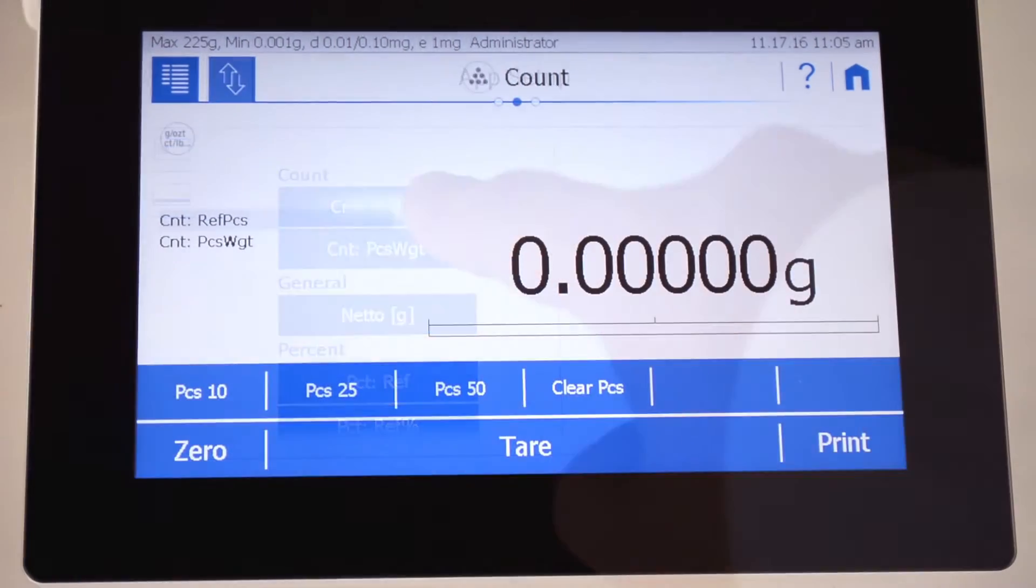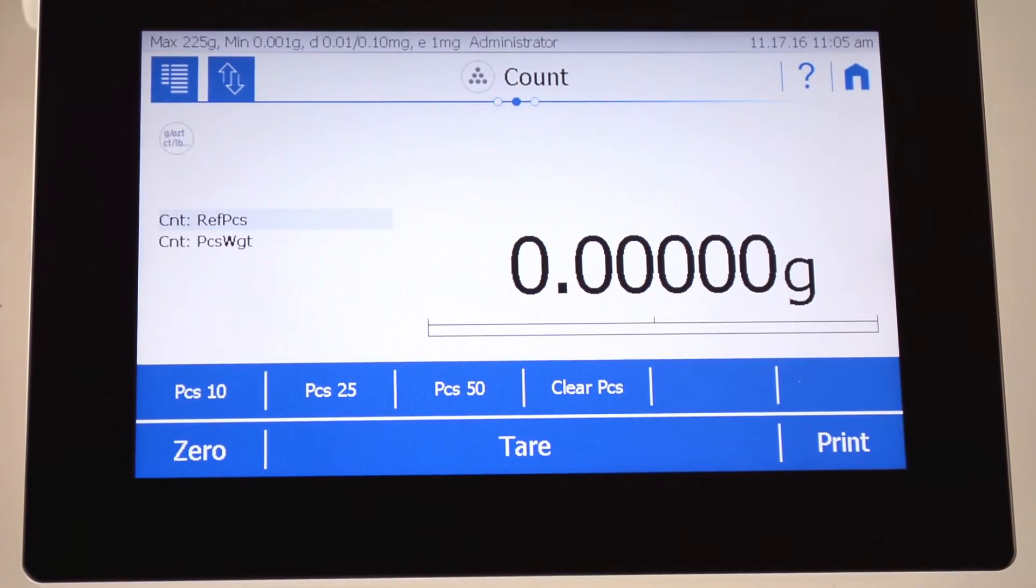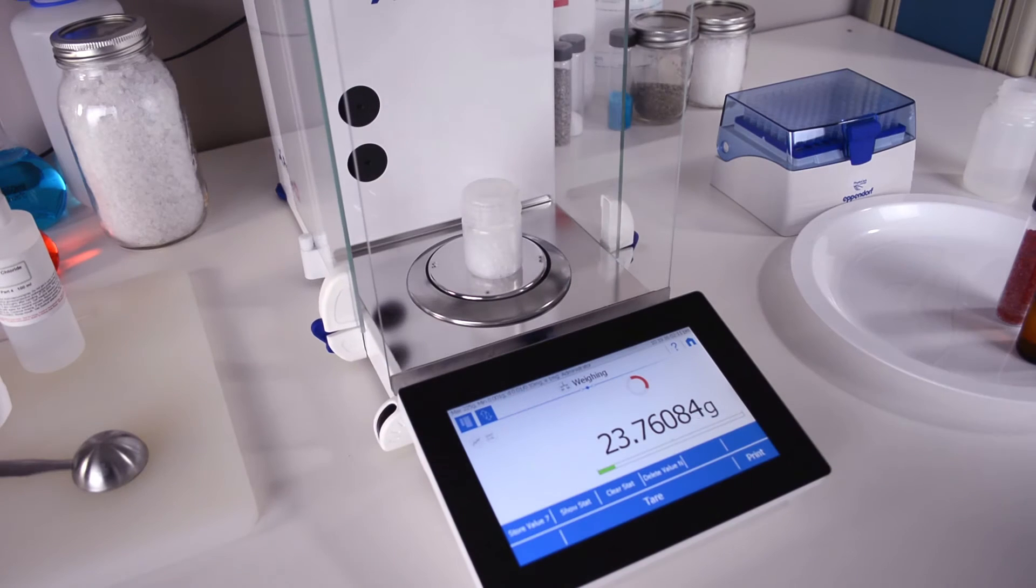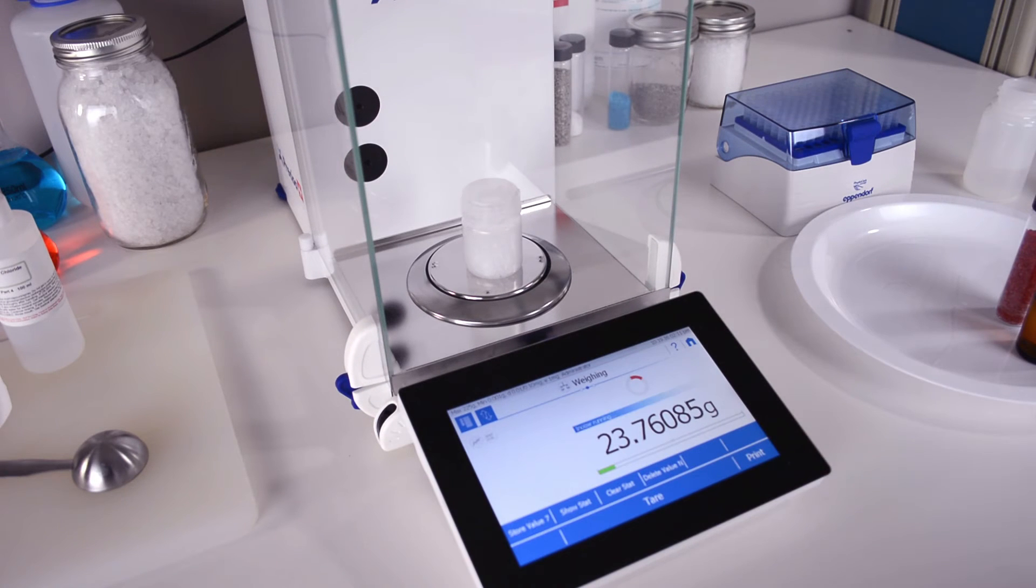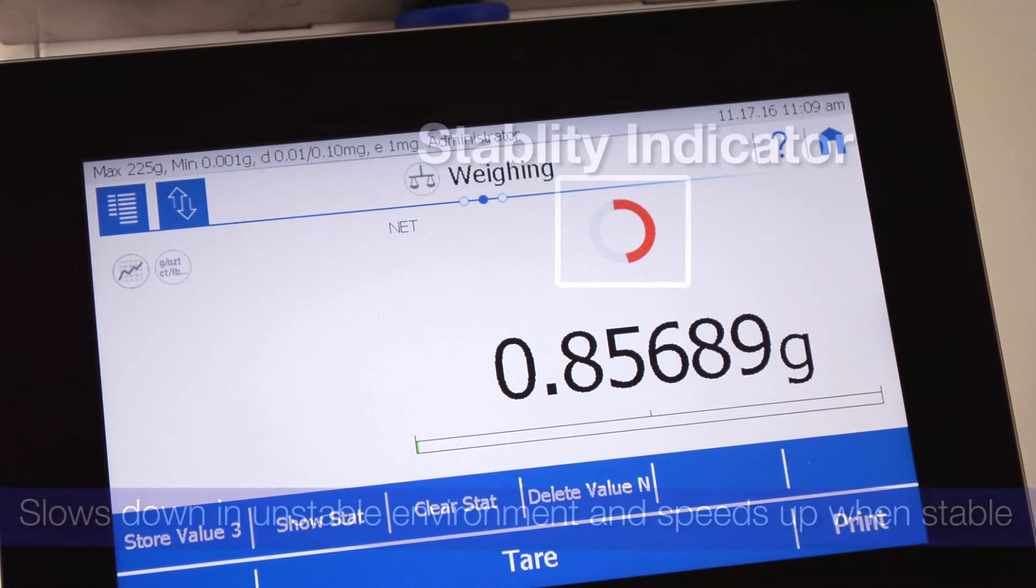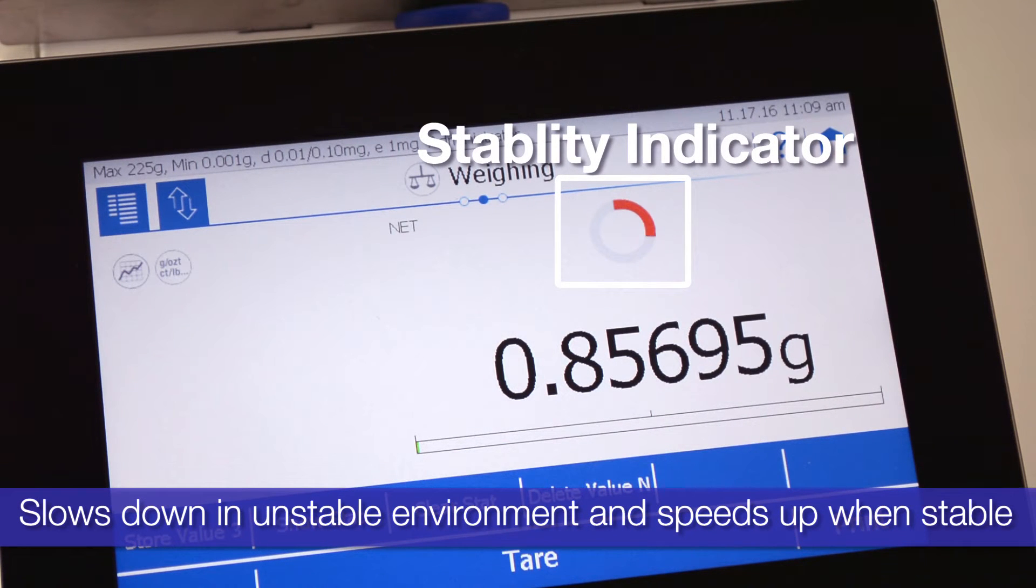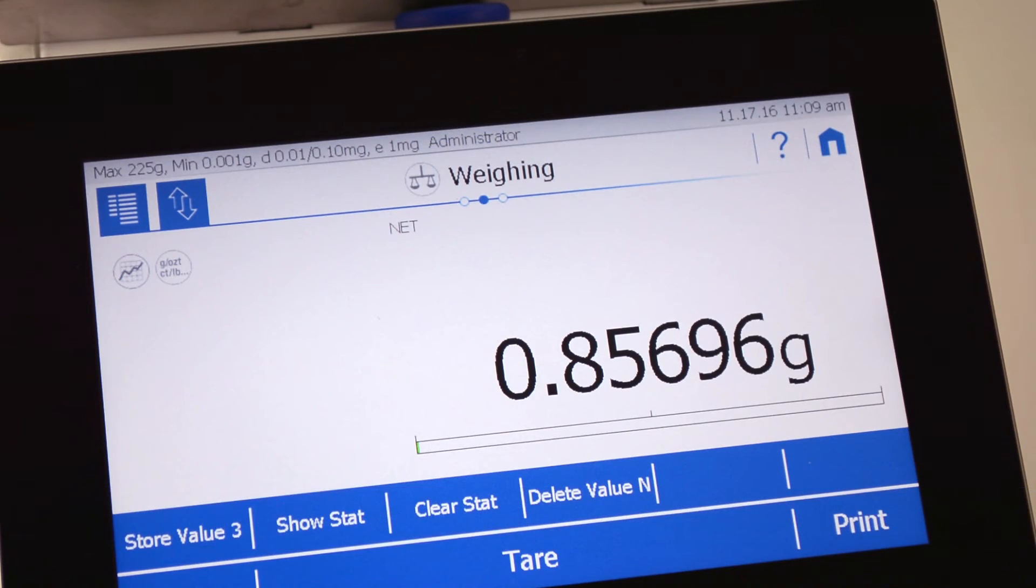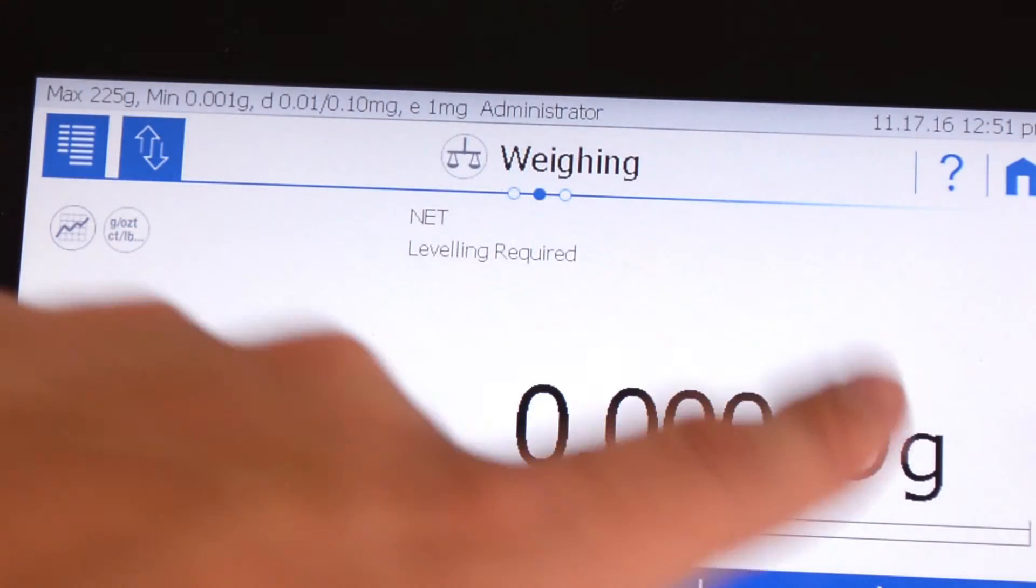The H series is especially designed to notify you of issues that can affect the accuracy of your results with its optical stability indicator and predictor. The balance detects anomalies in the ambient environment and speeds up or slows down to compensate. The balance will also notify you when it needs to be calibrated, linearized, or leveled.